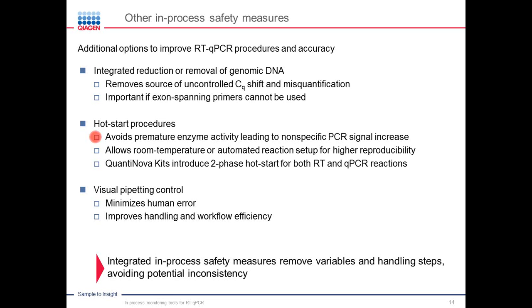The good thing about hot start is it also allows us to work at room temperature when doing reaction setup. So it both creates convenience and higher reproducibility, but it also allows us, for example, a more relaxed handling and the option for automation, which also can add to the precision or reproducibility of our workflow.